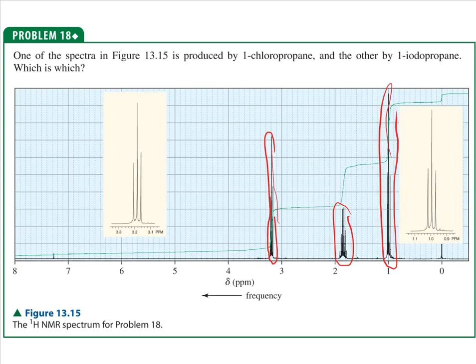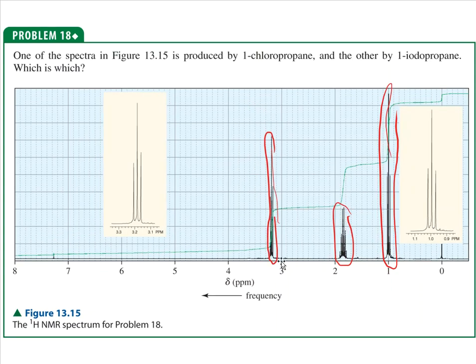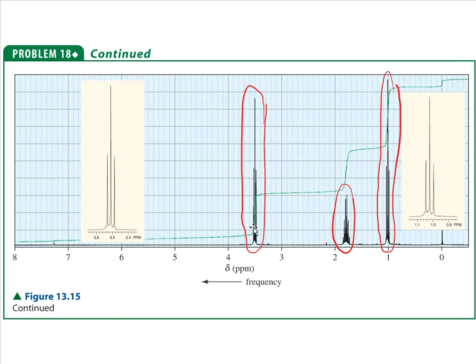So the first signal, they're both about 1s. The next signal here, it's a little bit before 2, and then this one is a little bit before 2. So it looks like those are in the same positions, give or take a little bit, right? And then here with the first one, it looks a little bit above a 3. So I'm going to say like a 3.2-ish, a 3.3-ish. And then for this one, it's shifted a little bit further up. This looks like a 3.5 or a 3.6-ish.